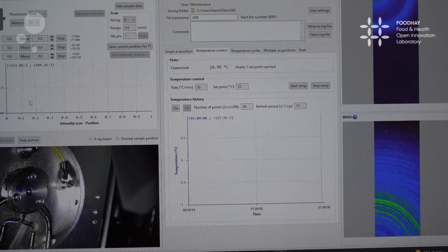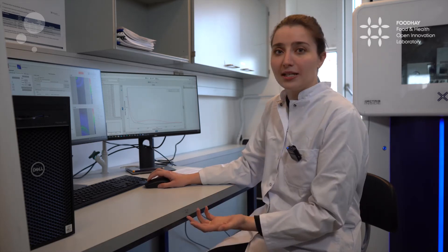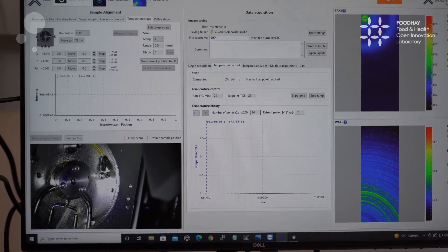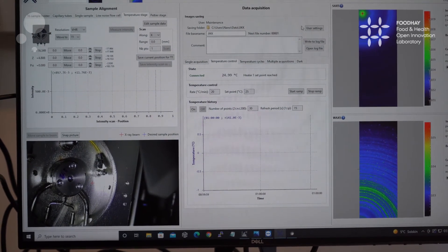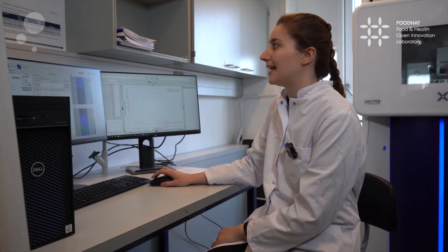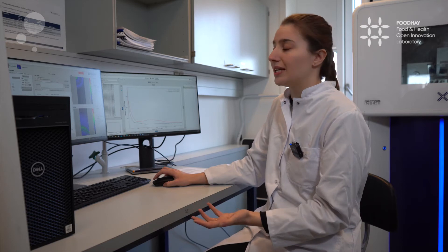To start the measurement, it is important that we are working with the right parameters. Here we can fine-tune the system. We can choose at which exact position the X-rays shall hit the sample, and we can monitor the progress in a live feed of the sample stage. Once we set up all the parameters and choose where our data wants to be saved, we can begin the measurement and get an estimate of how long it will take.